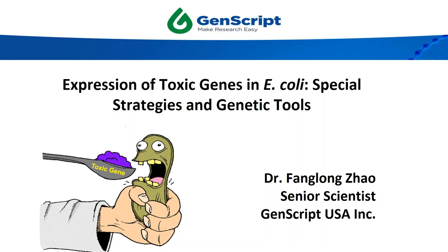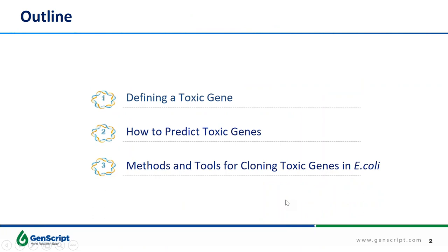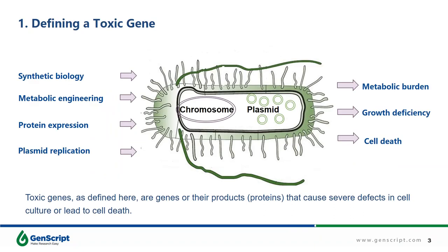Today, the topic of this webinar is how to express toxic genes in an E. coli expression system. The webinar is structured in three parts. In the first part, we will talk about what kinds of genes are toxic to the host. In the second part, we will describe how to predict if certain genes are toxic. And in the last part, we will describe some methods and tools for cloning toxic genes in E. coli. Now let's start from the first part: the definition of toxic gene.